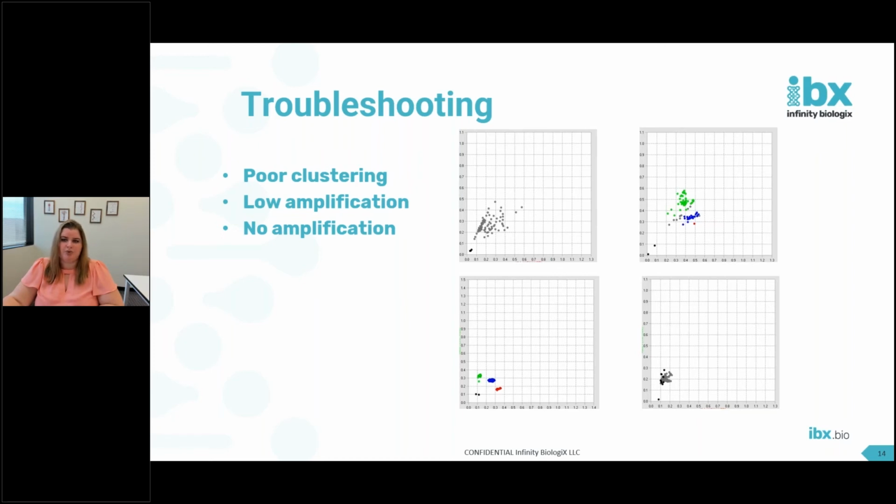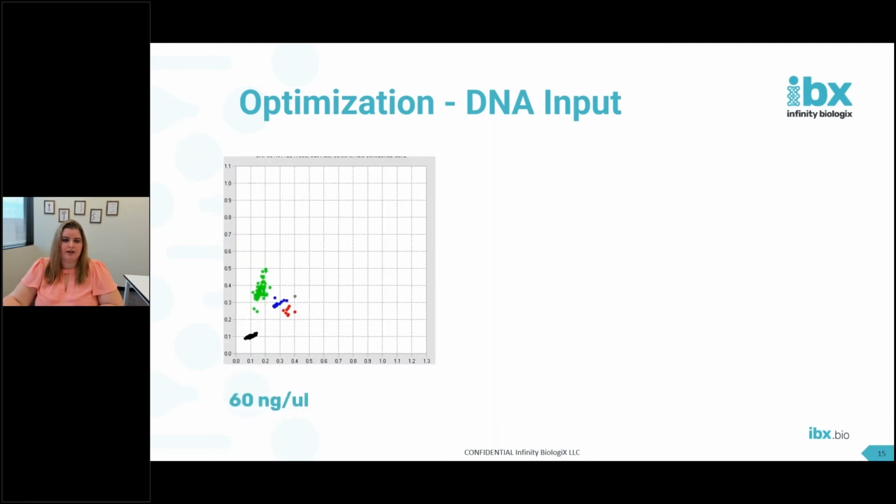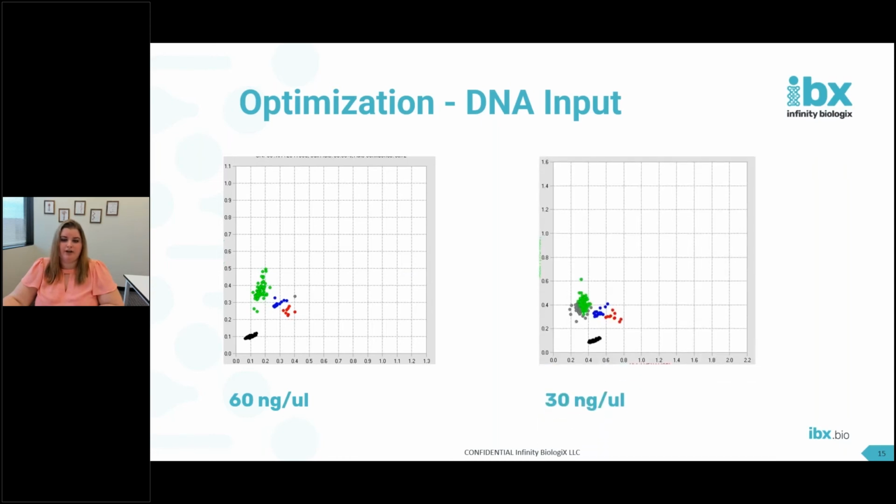So once you have something like this, you want to go forward to optimizing your assays and seeing how you can get them to perform better. One of the first things I look at is the DNA input. So for this particular assay that we were optimizing recently, I tried 60 nanograms per microliter to see how that worked. And while it sounds counterintuitive, I also tried 30 nanograms per microliter to lower the amount that we had. Sometimes with certain assay types, the lower input works better. For example, with saliva, you sometimes have better results when you dilute them more than with, say, a high quality sample source like whole blood. So we still don't have results that I'm really happy with here.